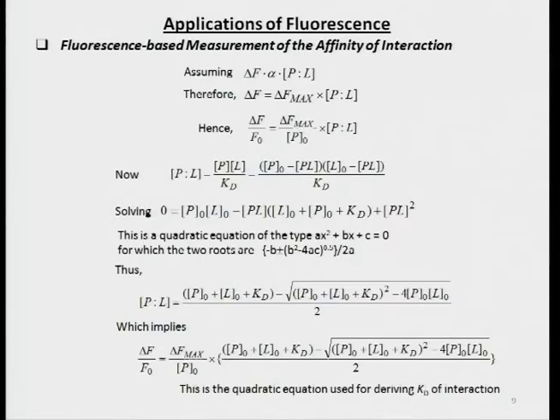So the idea is that the ligand, upon binding and formation of the complex, has to induce a change in fluorescence. That's the simplest thing, right? That's the idea. So without it, this won't really work. There are a number of ligands where the protein has a tryptophan. They would bind, and yet they would not change. So keep that in mind.